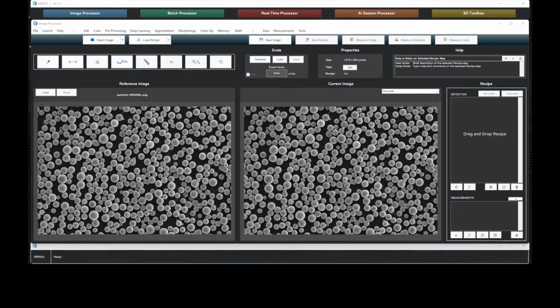When performing characterization of powder particles, EM data can pose unique challenges, including particle overlap and varying contrast. In the past, this analysis would be done manually. An operator would measure the particle's diameter and record the result. This manual process was extremely time-consuming, especially for larger sample sets.